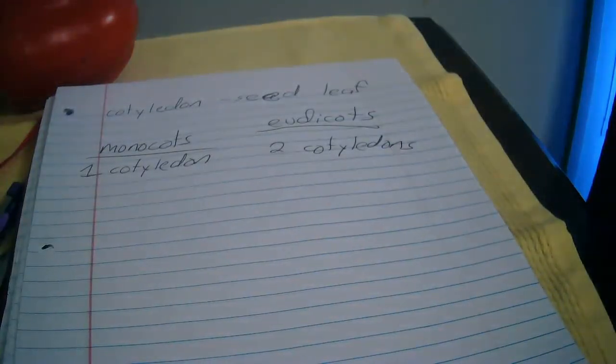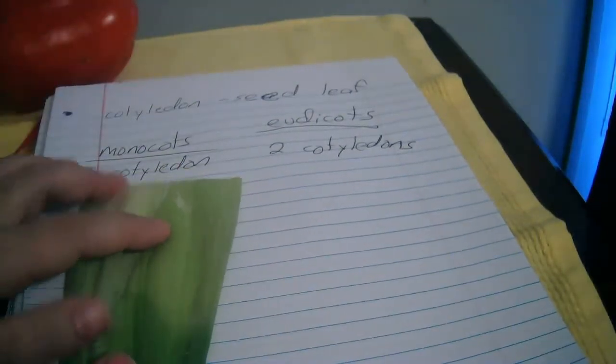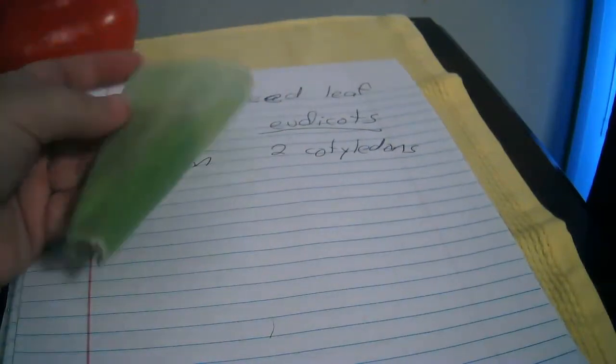There's another thing, the veins in a monocot. We call them veins in leaves. The leaf venation is parallel. Can you see that here?